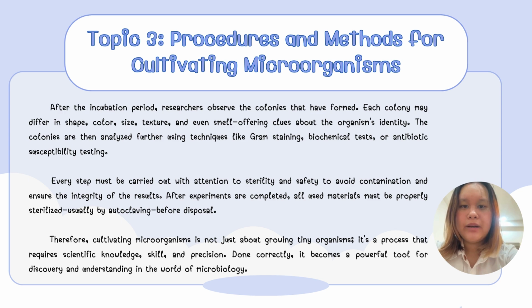Every step must be carried out with attention to sterility and safety to avoid contamination and ensure the integrity of the result. After experiments are complete, all used material must be properly sterilized, usually by autoclaving, before disposal.